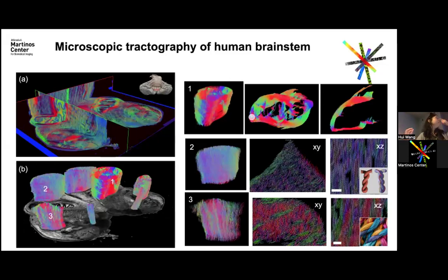There's also a trade-off. If you use a higher magnification lens, you can see higher resolution, but you also lose your depth of focus, which means the range within which all the image is in focus in Z. With higher magnification, your focus is sharper, so you end up seeing less in focus in Z. Then you have to do a Z stack, like a traditional microscope, and that really increases the imaging time.